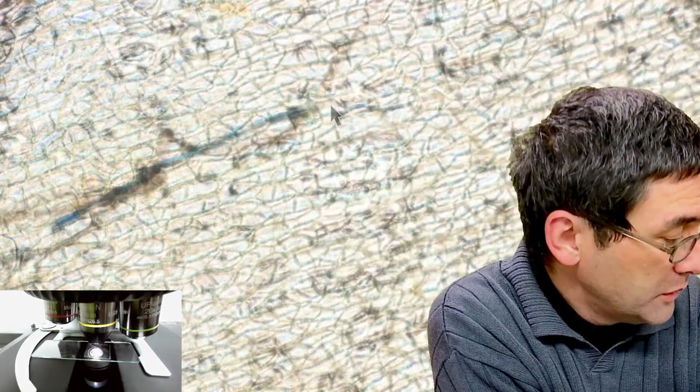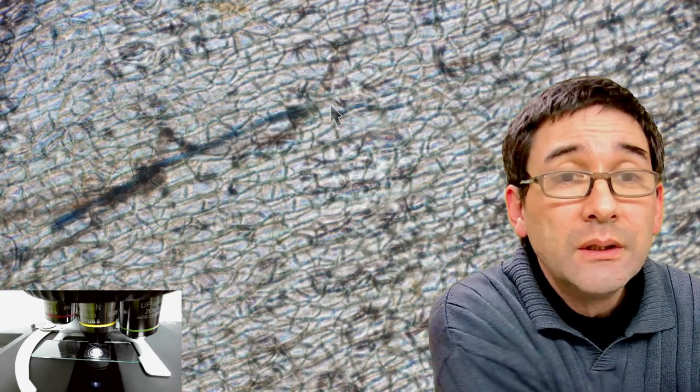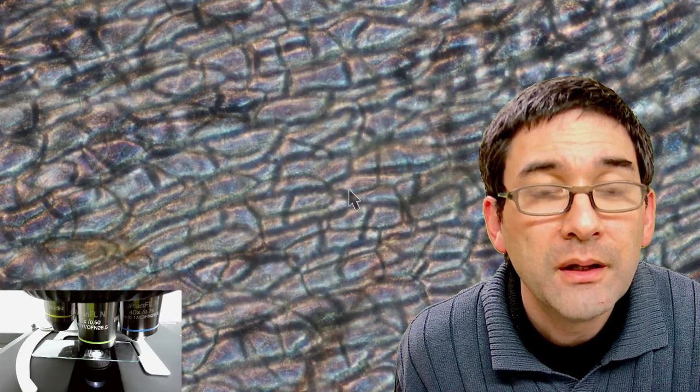Let's have a look at the real plant cells — hoping that I made it thin enough. You know what, I already had better results because I'm actually seeing multiple cell layers now. It's a little bit disappointing compared to results I got before. But if you just focus through it you're able to see that there are two cell layers on top of each other. So you can experiment around with that a little bit and compare how the cells actually look different.